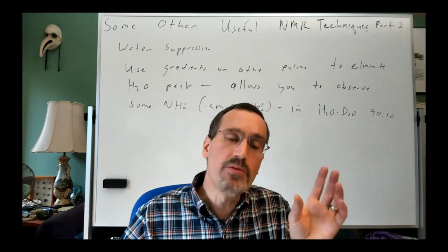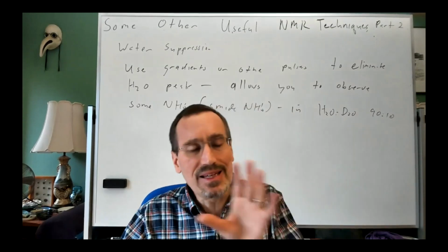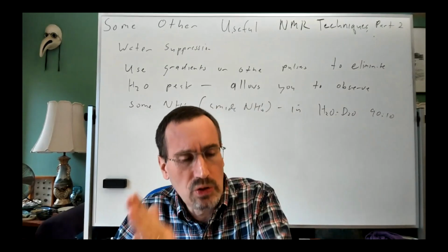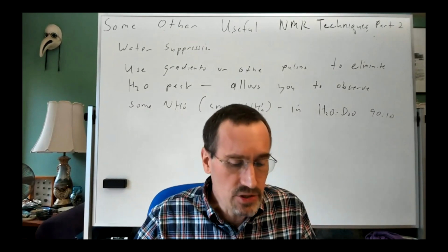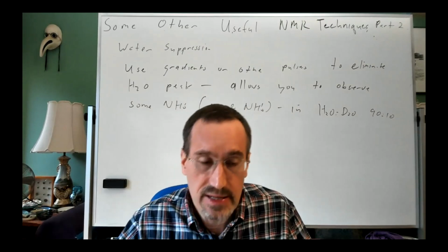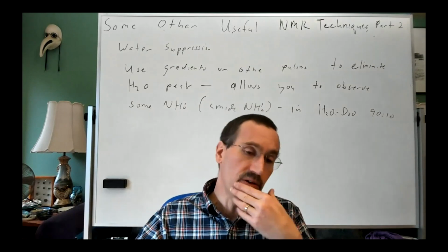a peptide or protein, as long as your pH is somewhere slightly either neutral or better still slightly acidic, you can see the NH groups. And I think that's where I will end today's lecture and maybe take a few final questions.